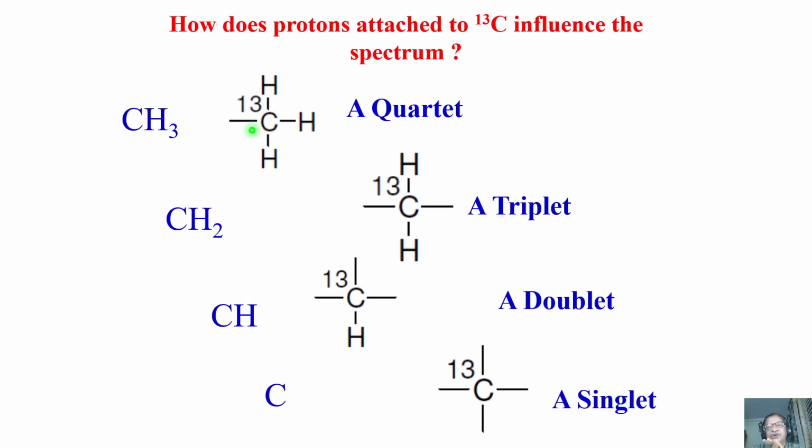Of course, sometimes we used to do off resonance decoupling, where you ensure only the carbons which are coupled to directly bonded protons show that coupling pattern. For example, the experiment is done in such a way that this carbon will only couple to these three protons, and we are going to see only coupling of the CH3 protons. So it will be a quartet. Similarly, it will be a triplet. Then it will be a doublet and no coupling at all. This is a type of spectrum normally it used to be seen.